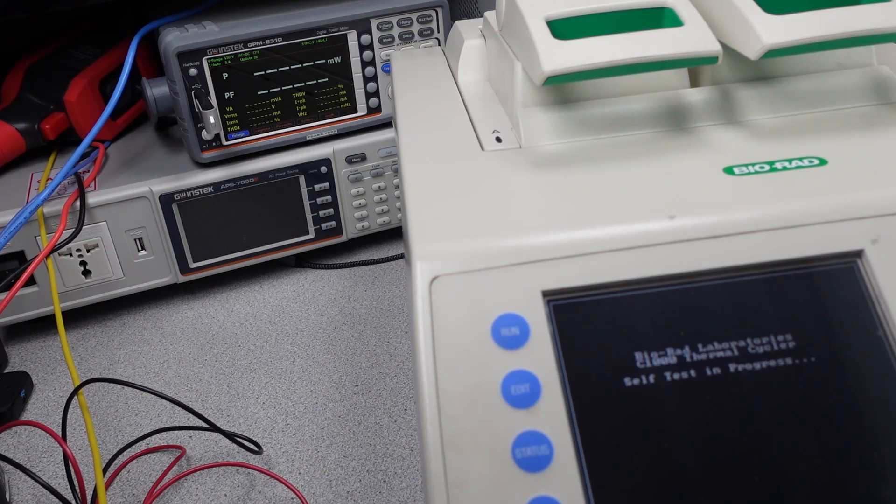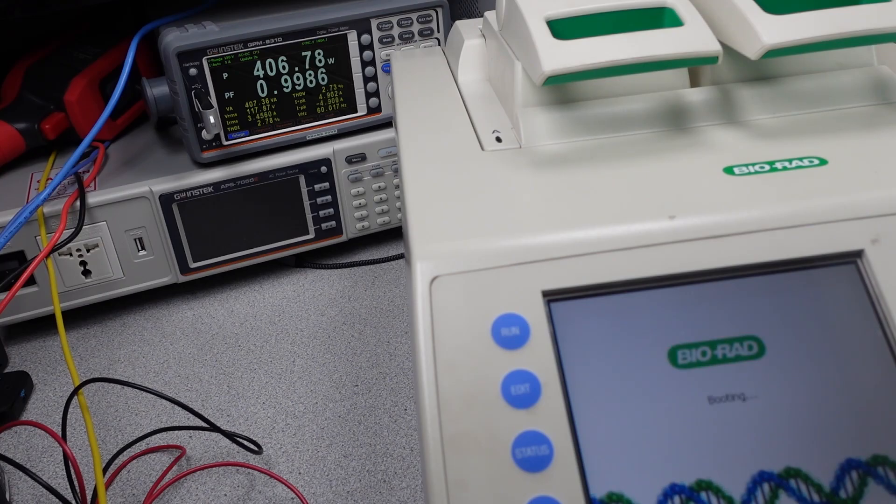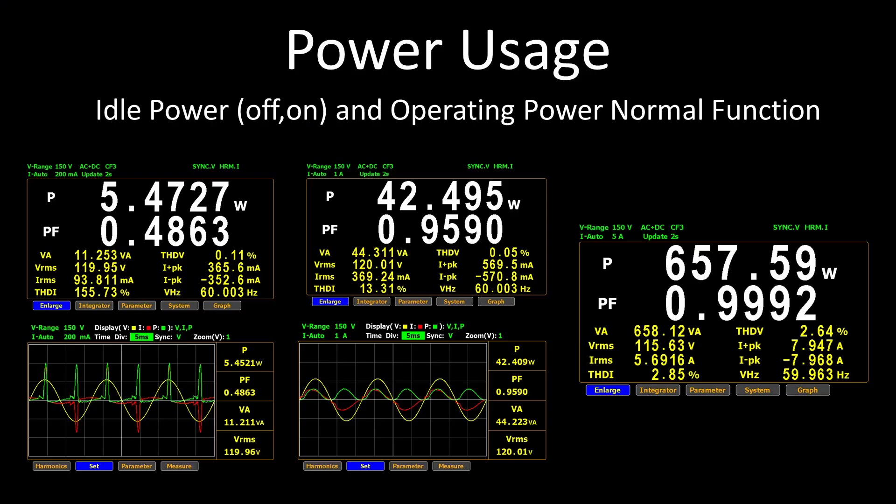Time to flip the switch — and look at that, it came to life. As expected this time, the power factor correction circuit booted up and the system appears to be operating normally. Time to get some experiments running and see if this thing can hold up and operate correctly. Ultimately the test of time will determine if this machine is actually repaired, but checking that it operates on the bench is important. It looks great. The waveforms are nice and clean. The power supply is operating exactly as expected — this has a very good power factor corrected power supply. The design is good, but it was all about time and the thermal design in the long run that took this power supply out. Heat is the enemy of capacitors.